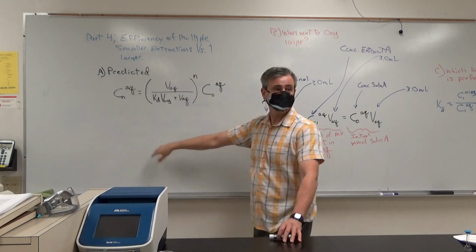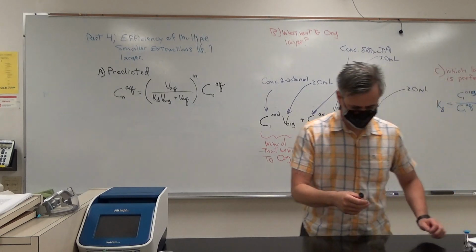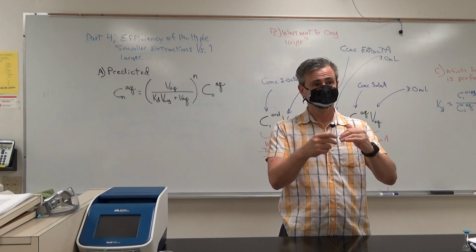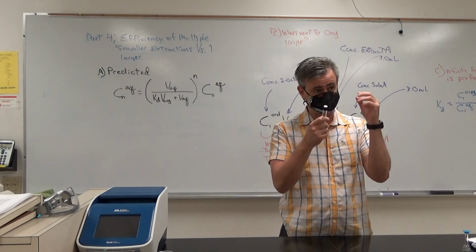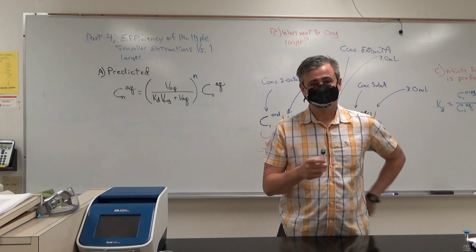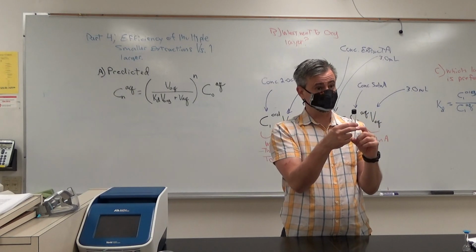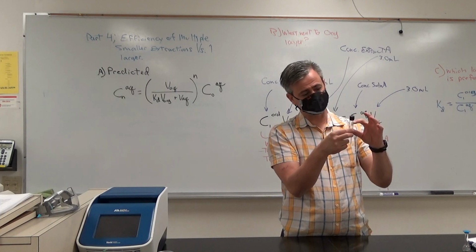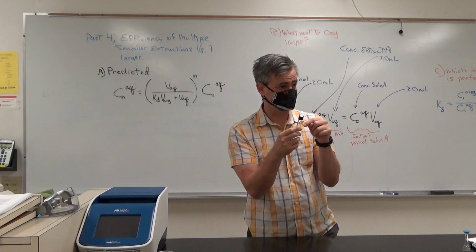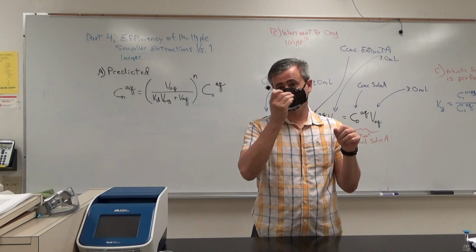Now we want to compare that to, well, what if we did it 2 times? By the way, I've had students do it 2 times and put brand new solution A in between. The whole point is to extract the same sample of solution A 2 times, so don't change that. You've got your solution A and your octanol. The second time, rather than add 3 mLs of octanol, you're going to add 1.5 mLs of octanol. You're going to shake, shake, shake.